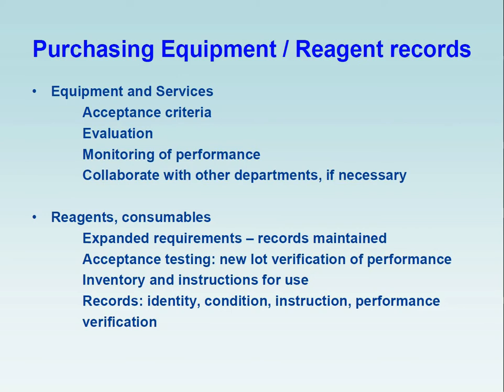Purchasing equipment reagent records. If you buy a piece of equipment, you need to have acceptance criteria. You need to evaluate that piece of equipment. You need to retain all of the evidence that it does what it says on the packet. You need to constantly monitor the performance of those. And if possible, you can collaborate with other departments. So this is very onerous.